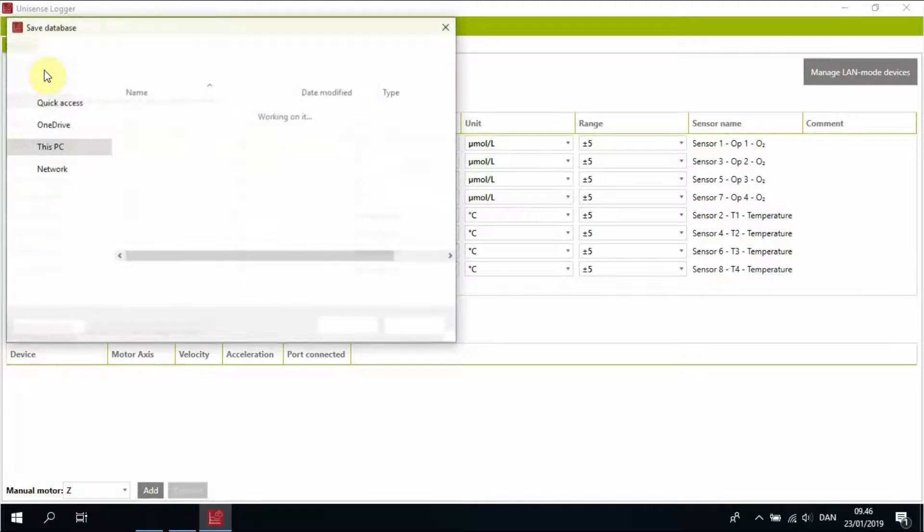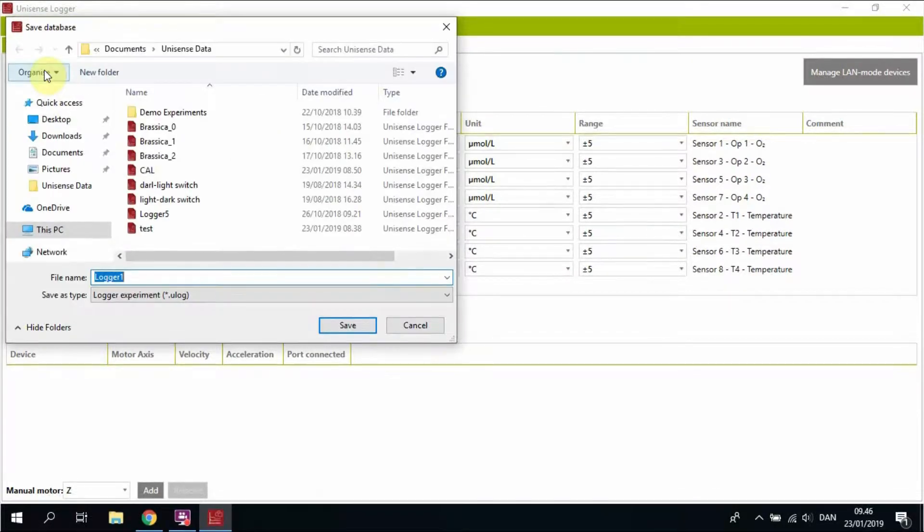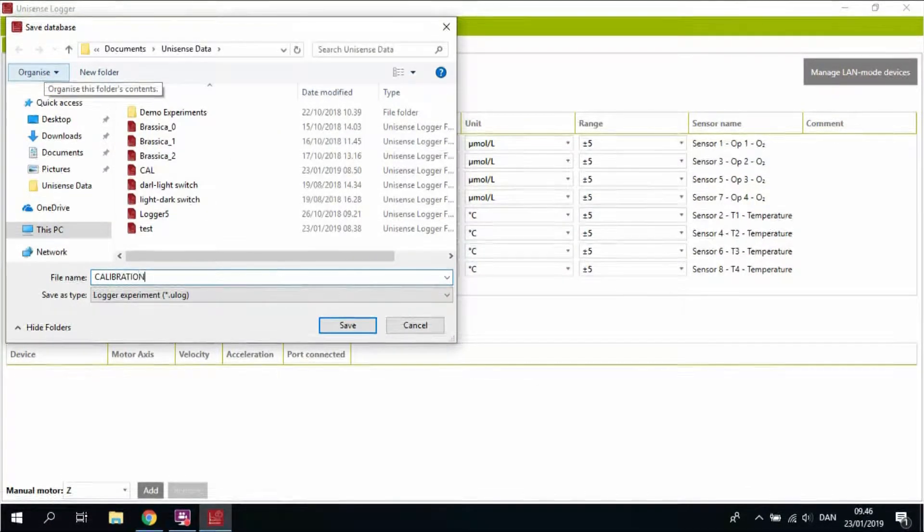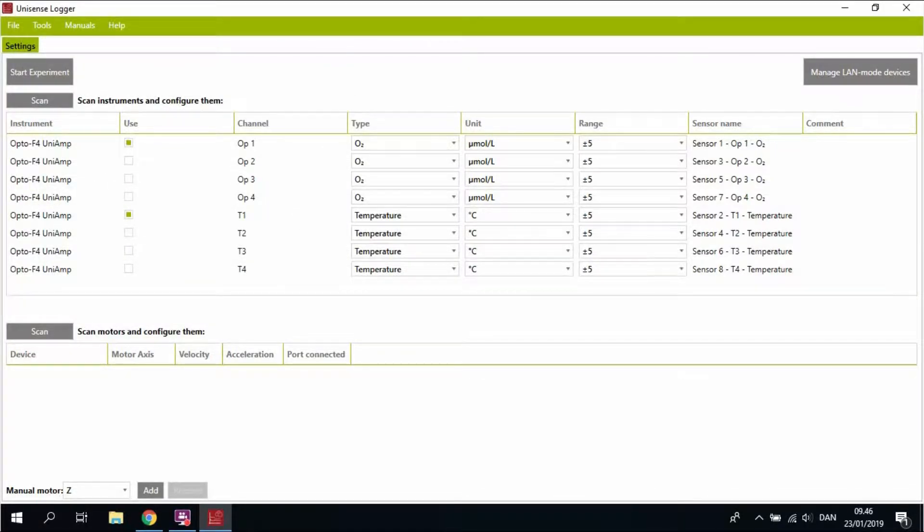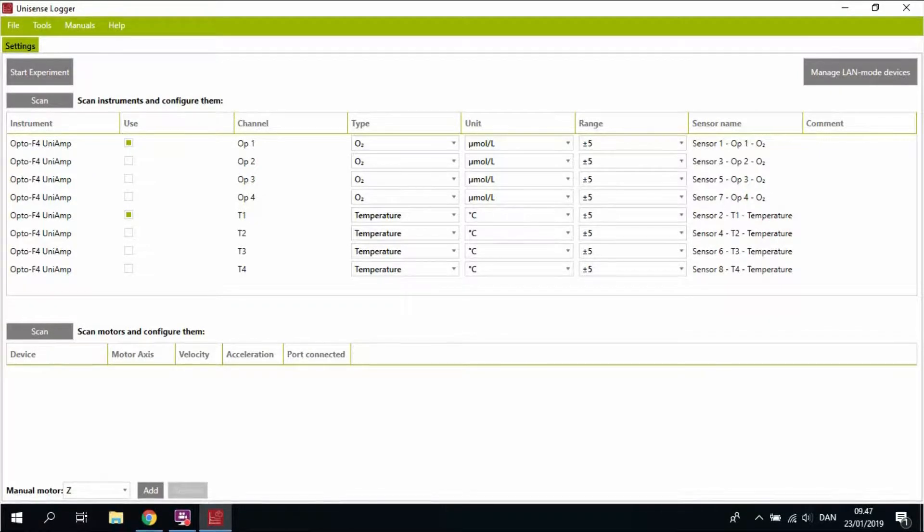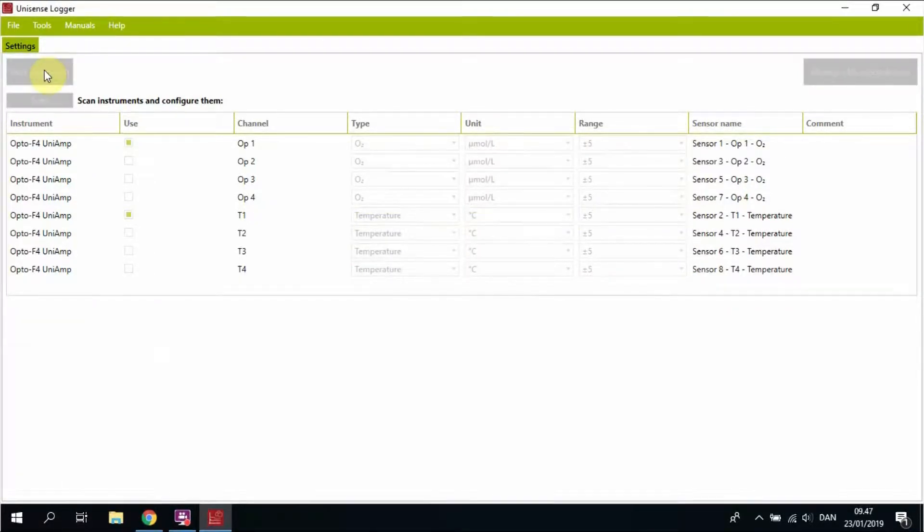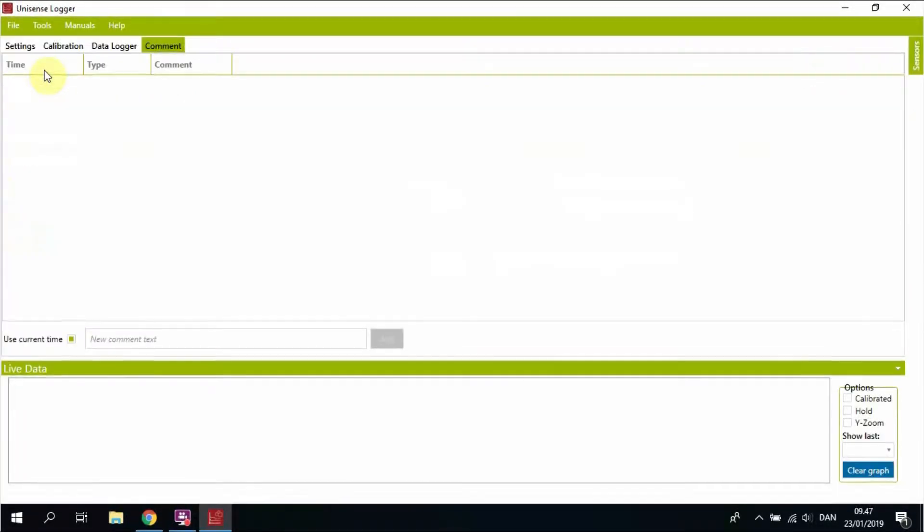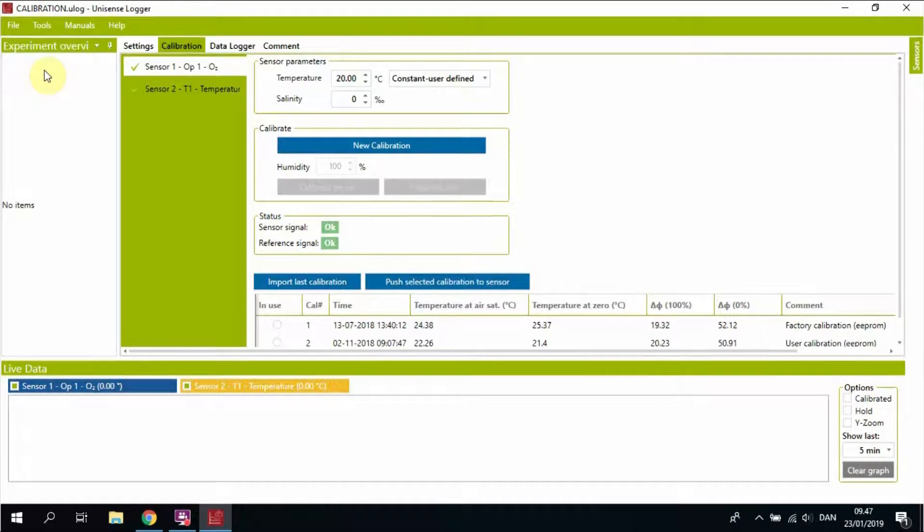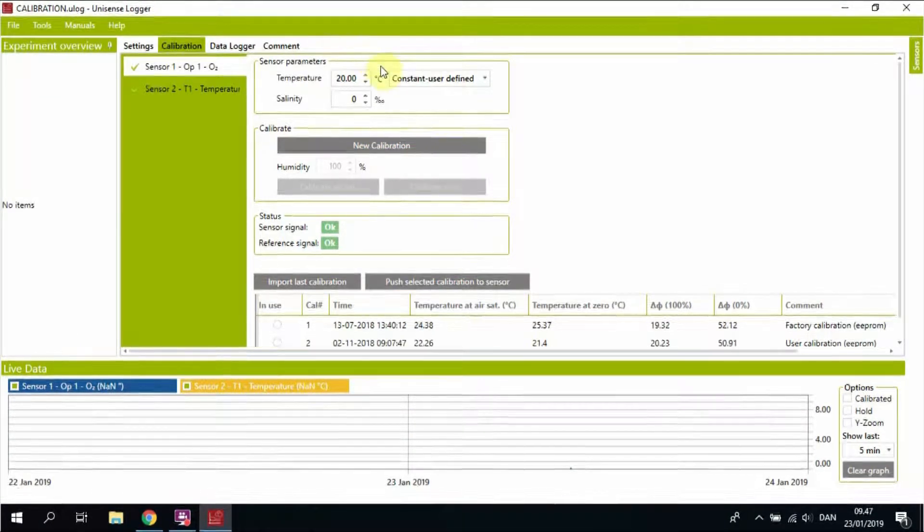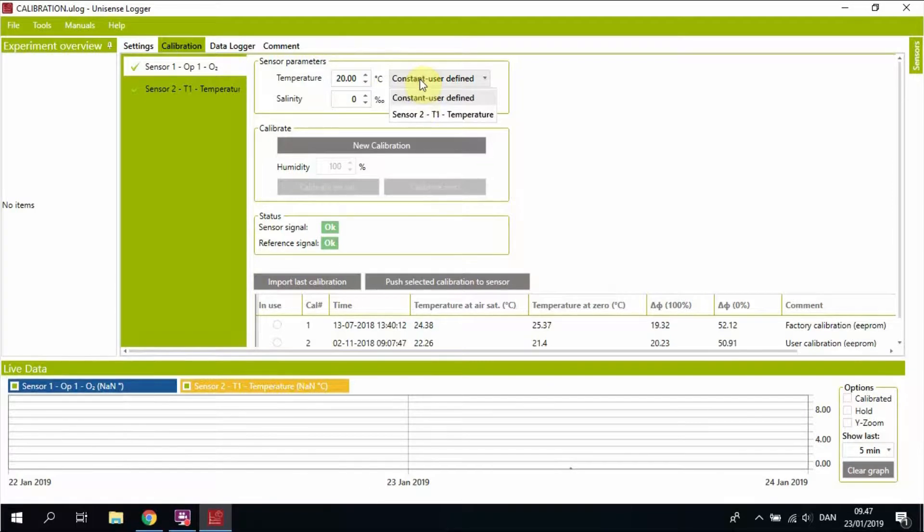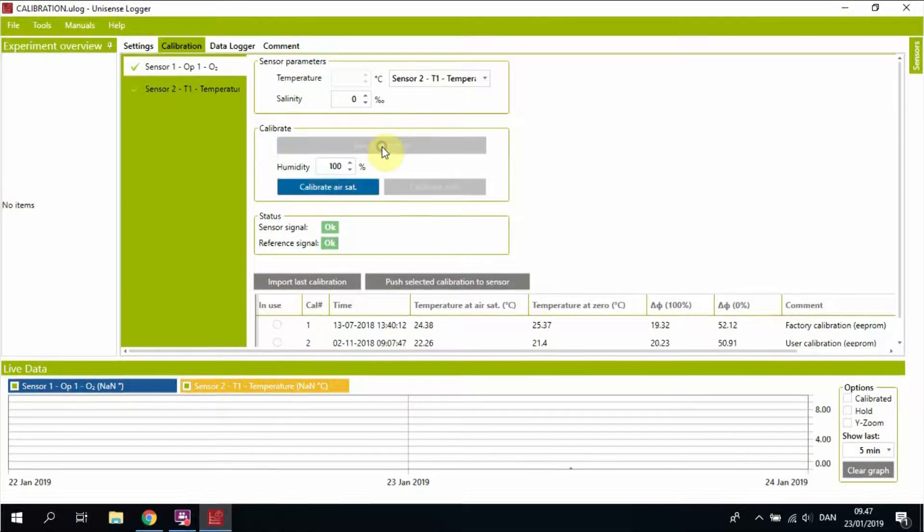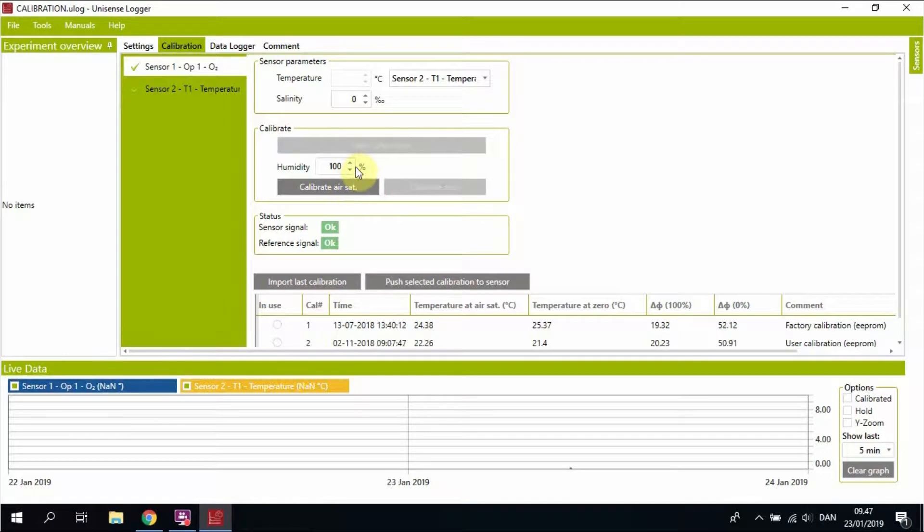Start the experiment and give your experiment a relevant file name. It will take a little while for the software to continue. First you select external temperature sensor. You select new calibration.